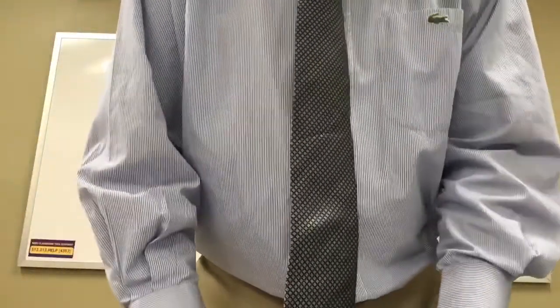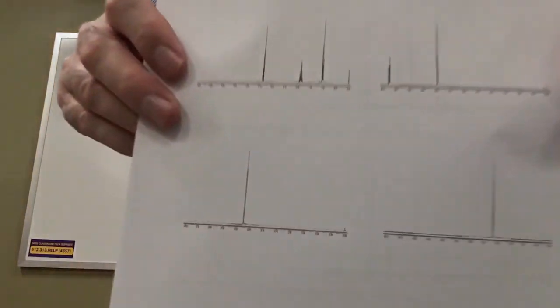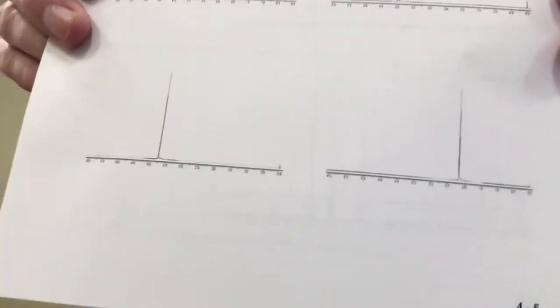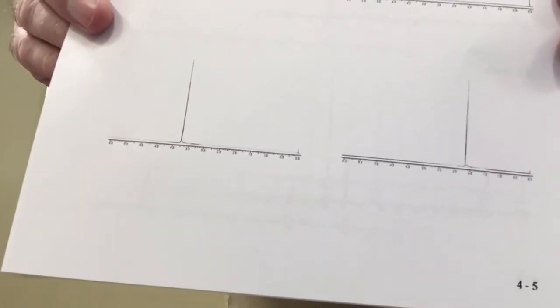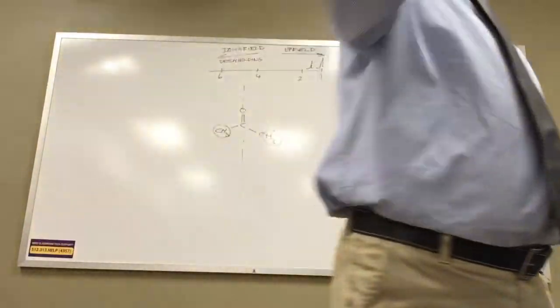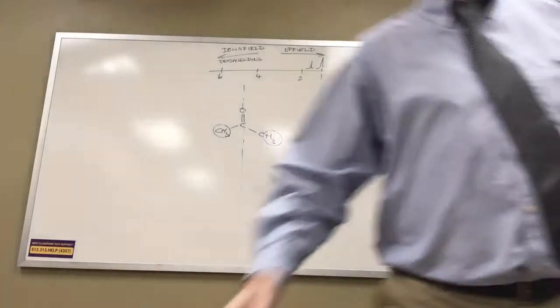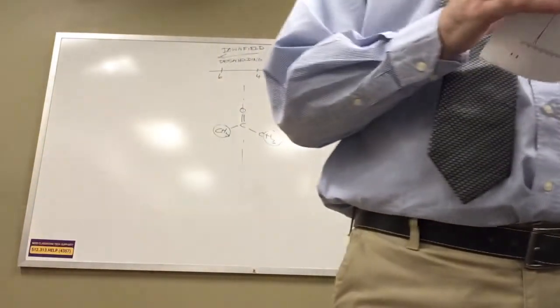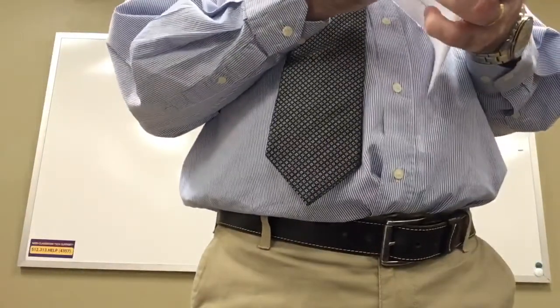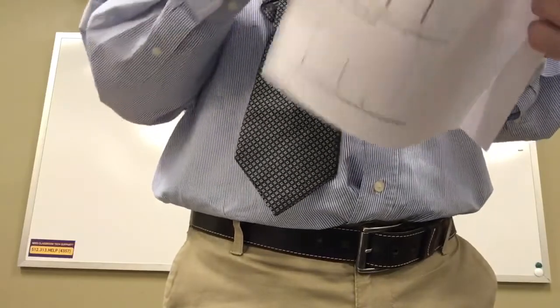But the problem is, there are 2 spectra, because there's a bromopropane, which is also... Okay. Well, what I would do is go to the, oh, you know what? So here's what we had to do. We had to go to a correlation table.